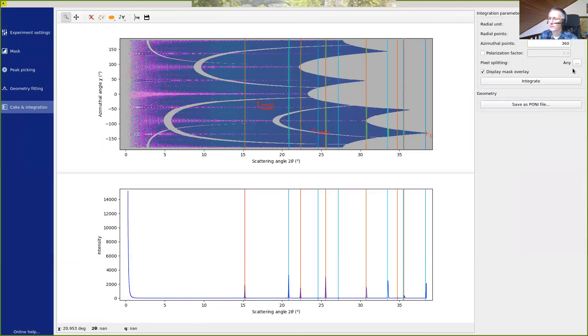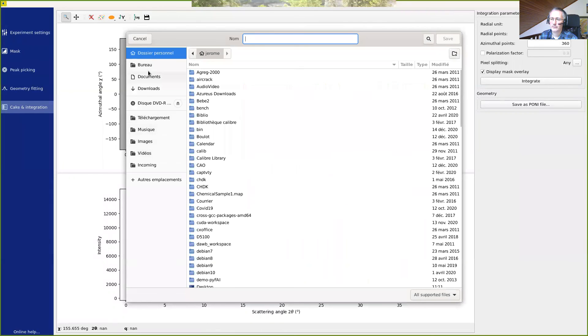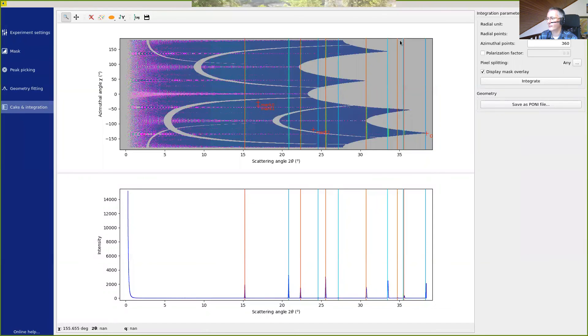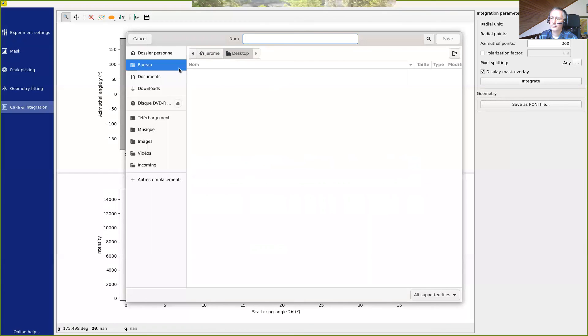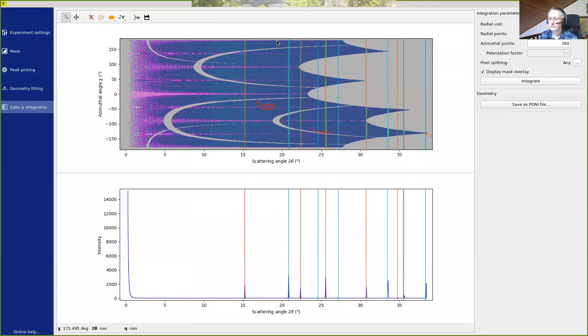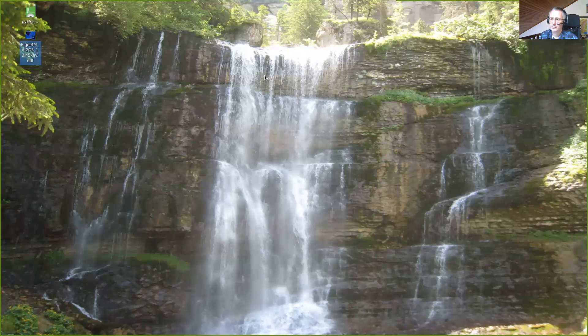So the last thing we can do is save the pattern. You can save integrated directly on the desktop and also save on the desktop the geometry. Okay so that's it with this application, we can now close.